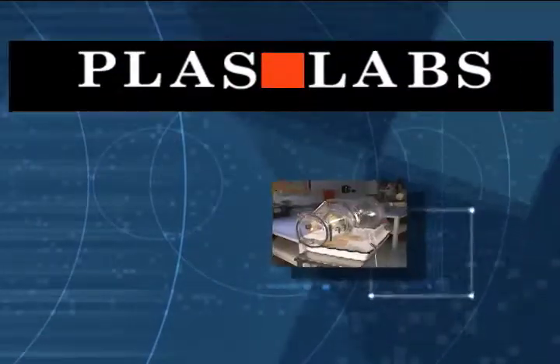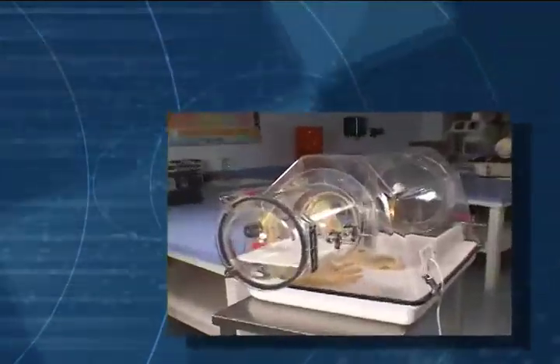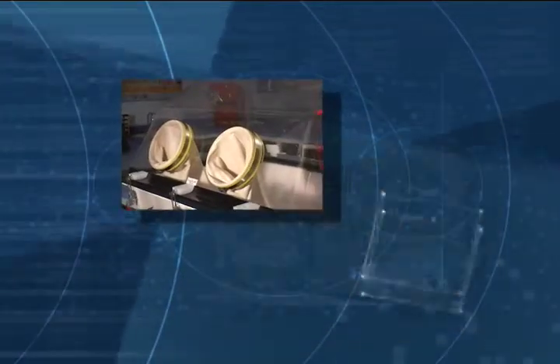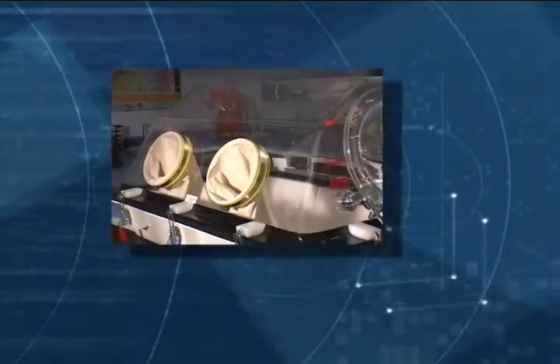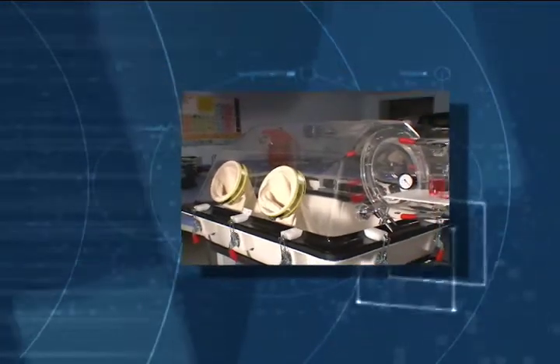Plaslabs is proud to show you some of our basic glove boxes. These boxes are engineered to fit general laboratory isolation applications, but can be easily modified for specific uses.